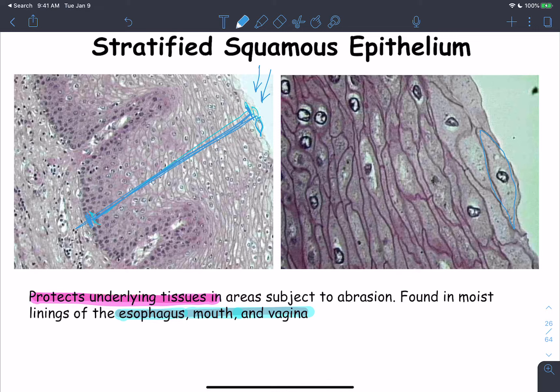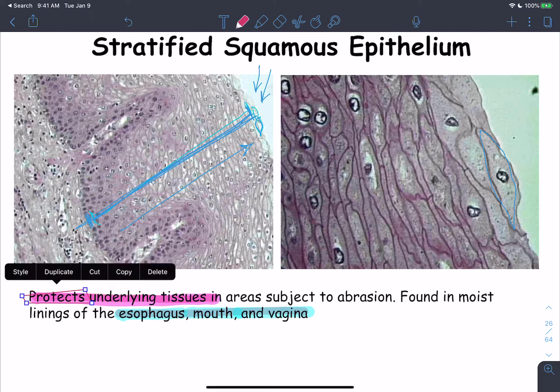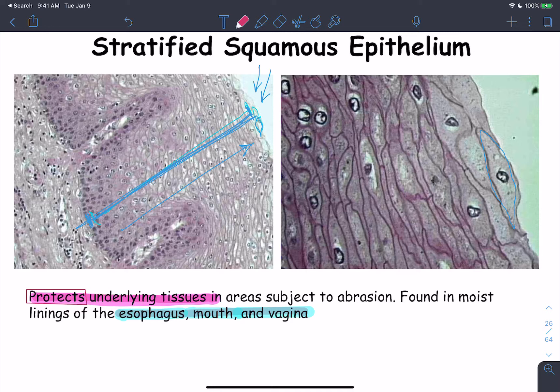Based on its appearance, the main function of this epithelium is to protect the underlying tissues. It is very important to remember that its main function is protection of underlying tissues in areas subject to abrasion. Three sites where the non-keratinized stratified squamous epithelium is found: the oral cavity, the esophagus, and the vagina.